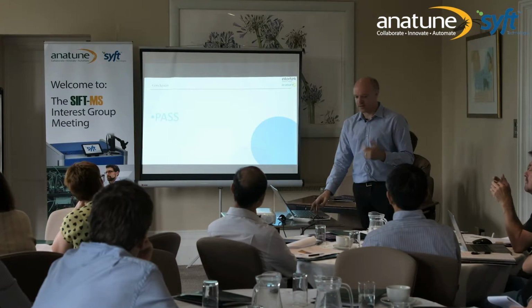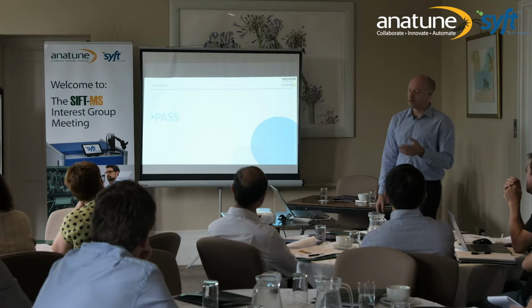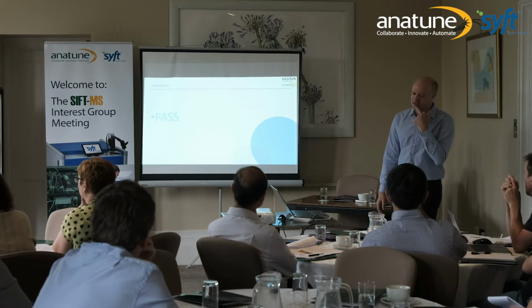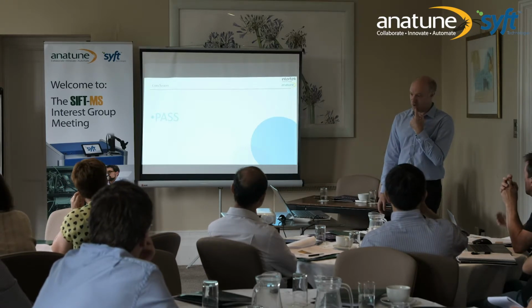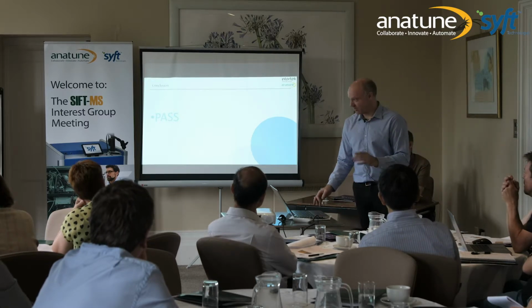And I think it was the first time they'd seen a SIFT-MS method for these types of submissions. I'd be interested to know how the MHRA or the FDA would audit this, because it's going to be odd for them, but I suspect they'll have to get used to it, because there's going to be more of this stuff about, I'm sure.